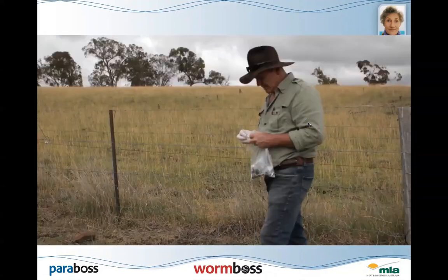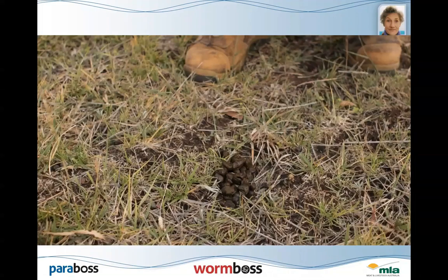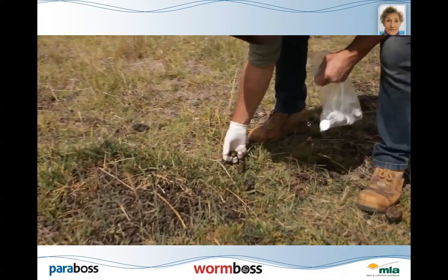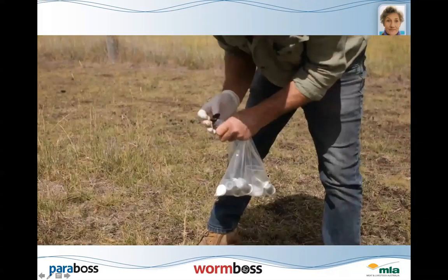Now, what you want to do now is find the piles of dung, and if you're collecting into the individual containers, you're going to pick up probably 5 to 10 pellets. Try and at least half fill the little jars, and you will do that until you've got all 10 of them filled up. I'll just show you there in this particular bag. There's a larger container there. They're the sort that you're going to use if you're going to collect a bulk sample.